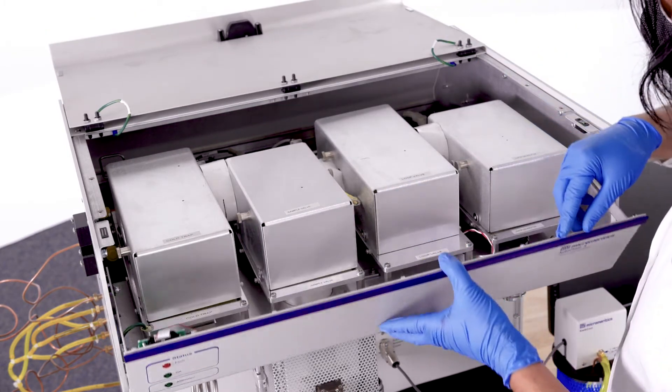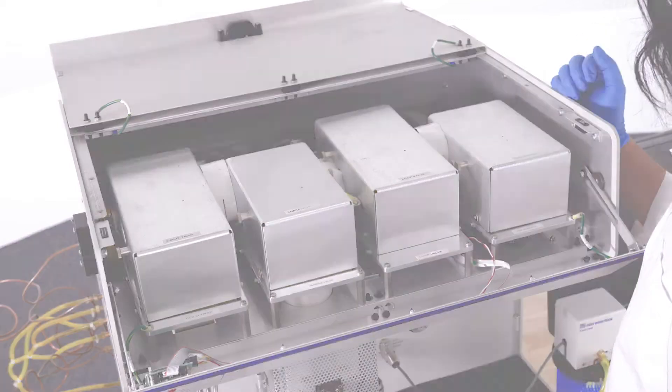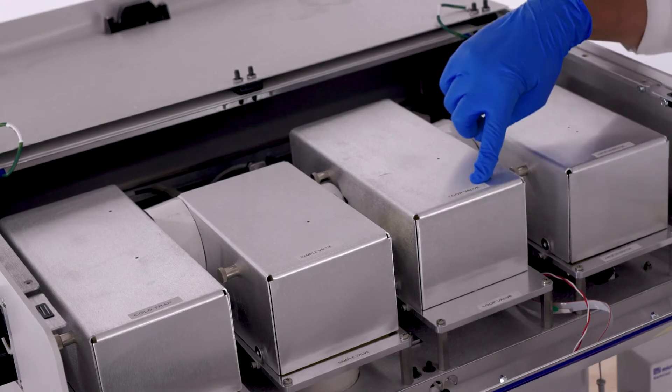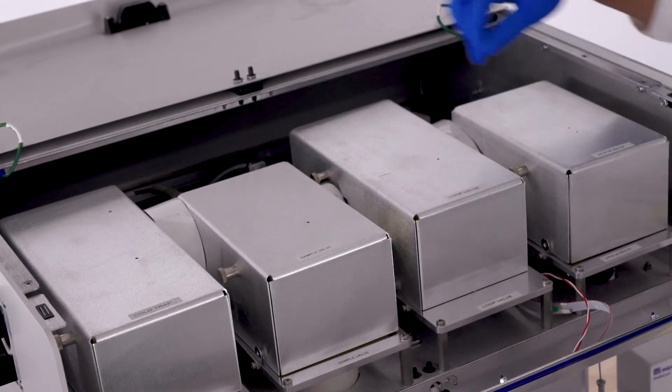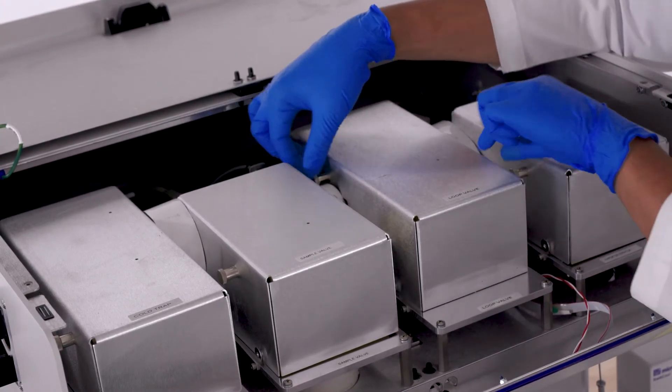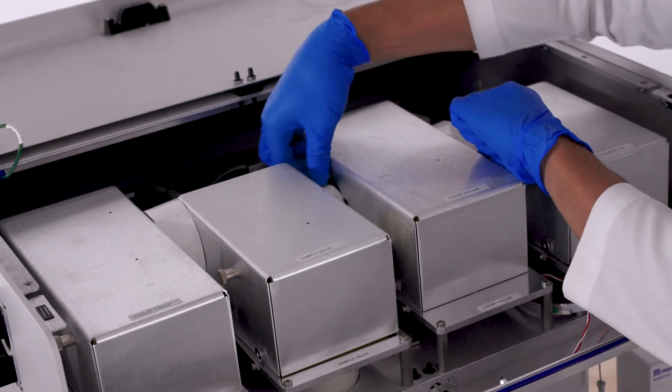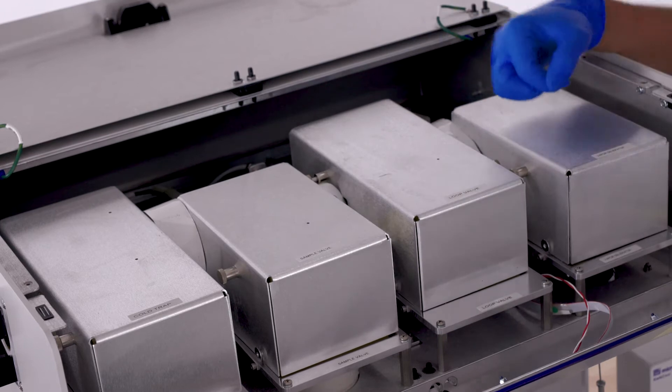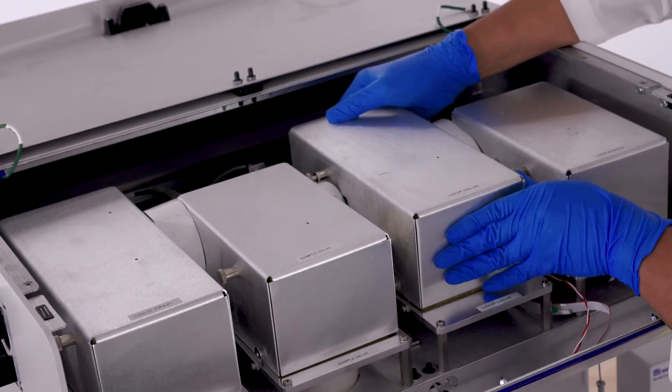Pull down the upper front panel for better access. Use caution, the internal components may be hot. Next, locate the loop valve cover. It is the second box from the right and is held in place by two knobs. Pull outwards on the two knobs until the cover is released, and pull upwards to remove the cover.